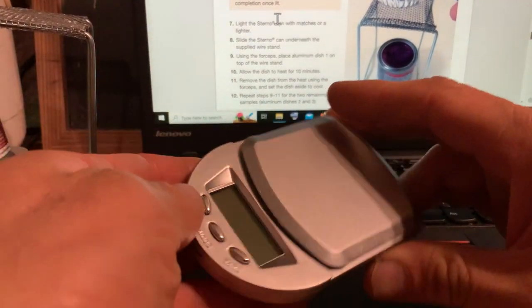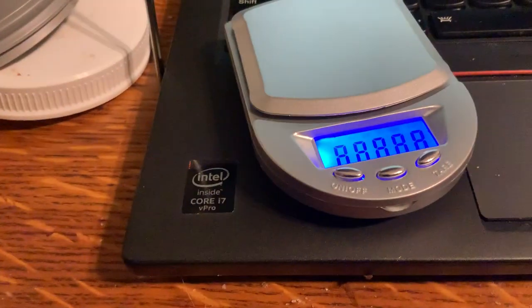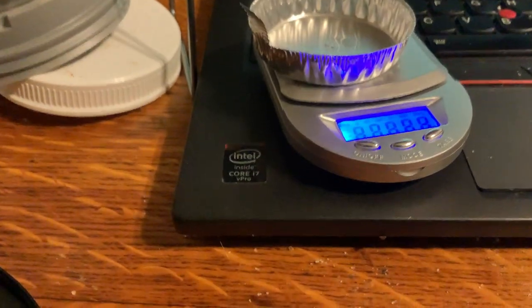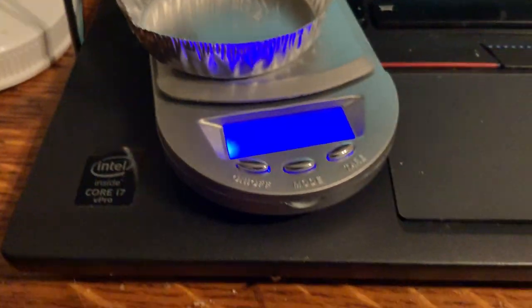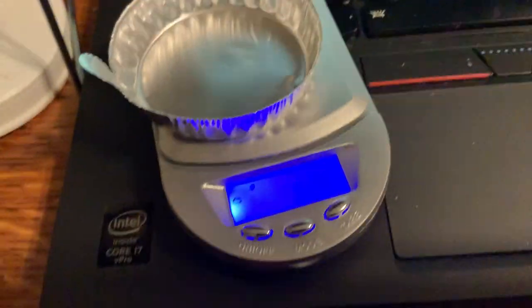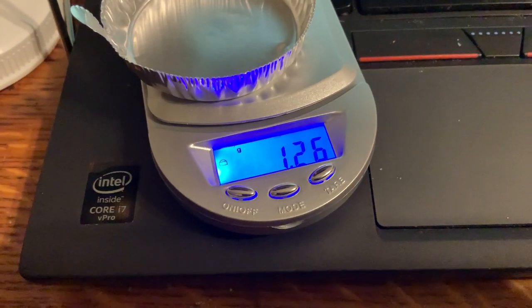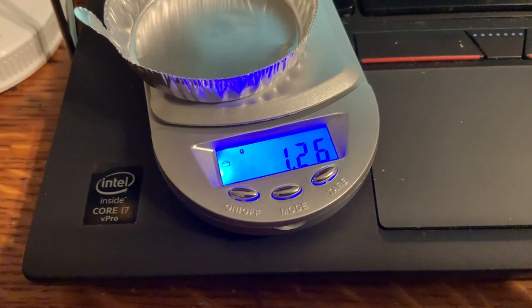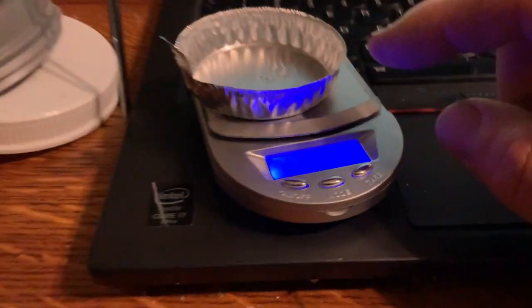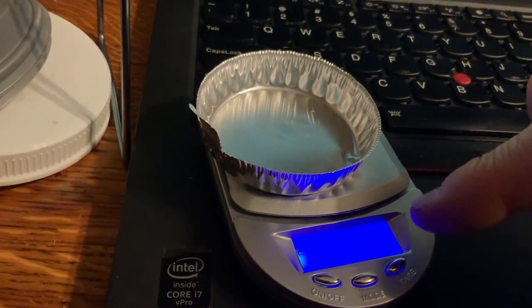I turn the balance on and it says 0. I put the pan on and it reads 1.26. So if I want 0.3 to 0.8 grams of Epsom salt, I'm going to add something like 0.7 grams, meaning I want the total to read 1.96. I keep adding Epsom salt until it says 1.96, which gives me 0.70 grams of Epsom salt. I take the pan off the balance and add some Epsom salt, then put it back on.